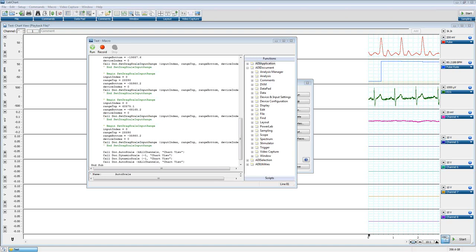Now, what that would require is being able to open the Excel file, find the correct cells in the Excel file, assign those to variables within our script, and then do things based on that. Now, in my head, I can imagine a way to do that, but I don't know enough about writing VB script for Excel to tell you how. But I do believe that's something that would be possible.